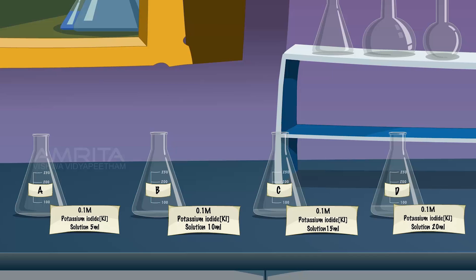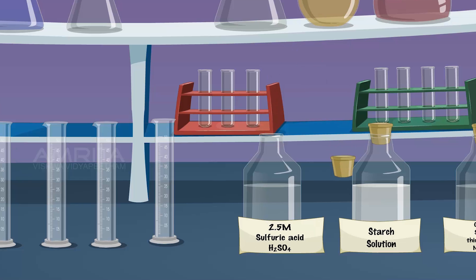Take 5, 10, 15 and 20 ml of 0.1 molar potassium iodide solution in four conical flasks A, B, C and D respectively. Measure 10 ml of 2.5 molar sulphuric acid in a measuring jar.